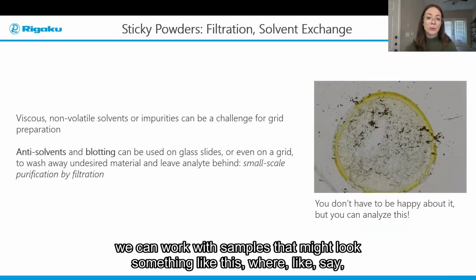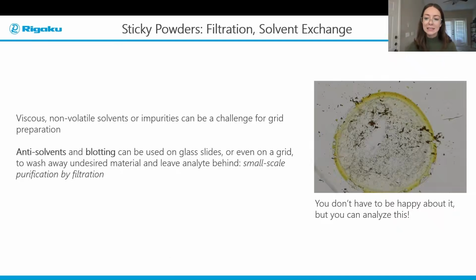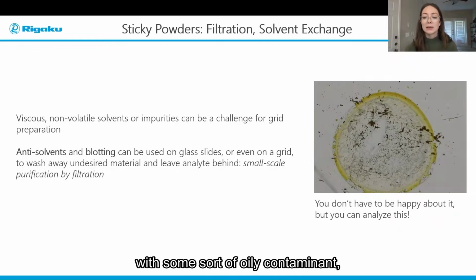Additionally, we can work with samples that might look something like this, where I like to say you don't have to be happy about it, but you can analyze it. So this is a mixture of crystalline material with some sort of oily contaminant.